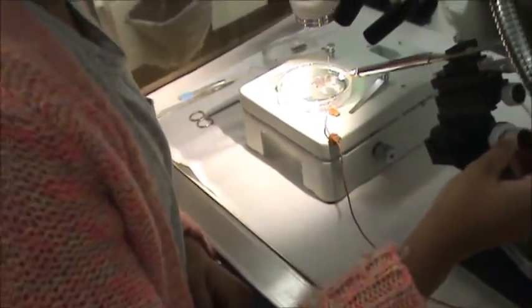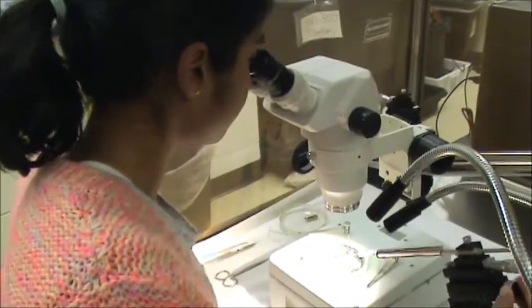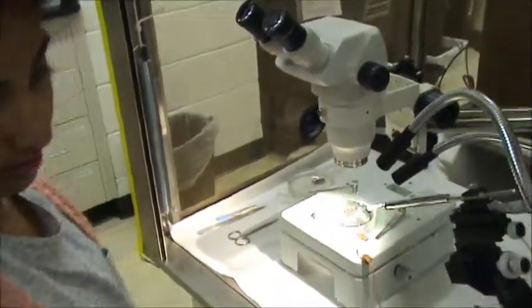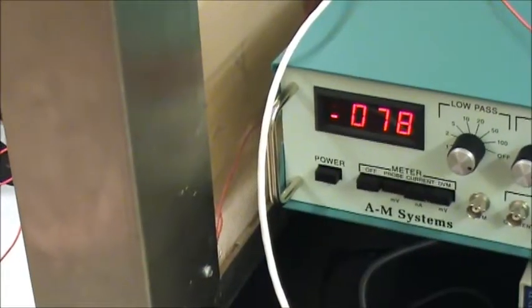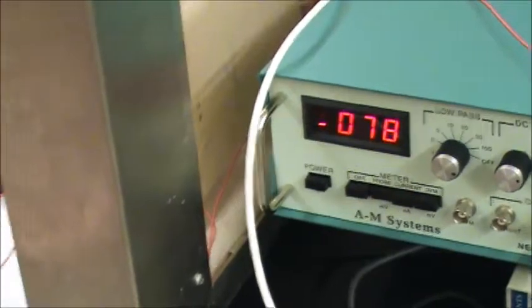And you can also kind of tell through your reading right here. So I have a reading that's about -77 millivolts. So I know I'm in the muscle right now.